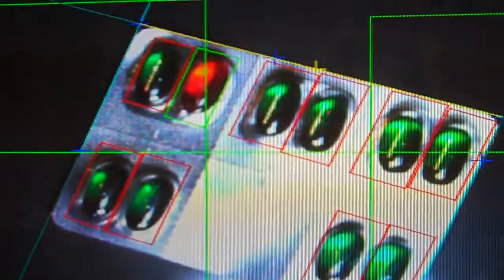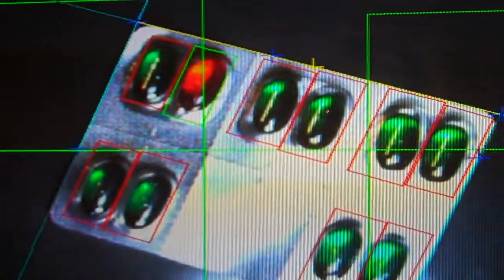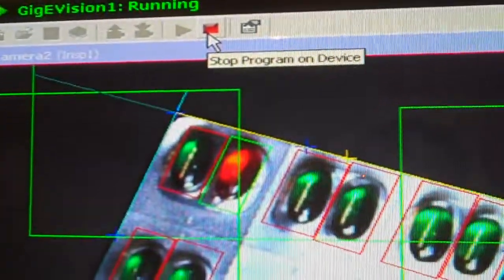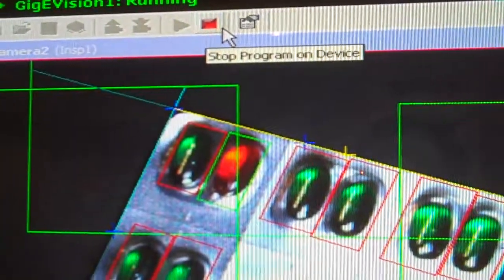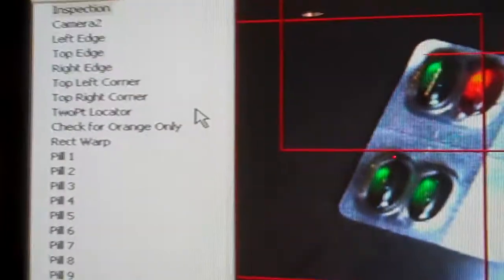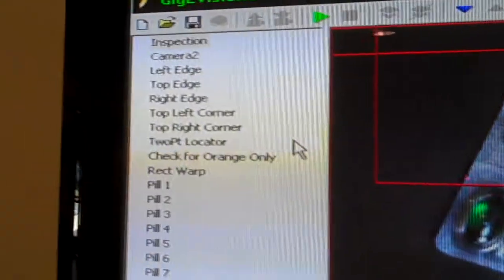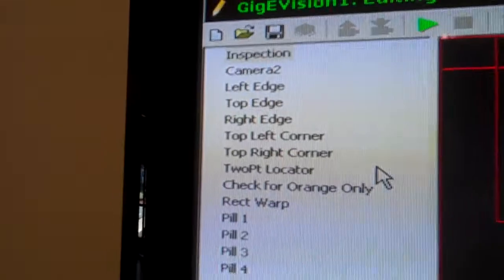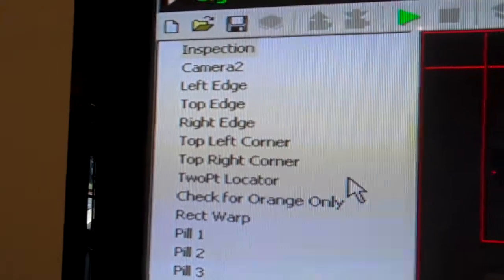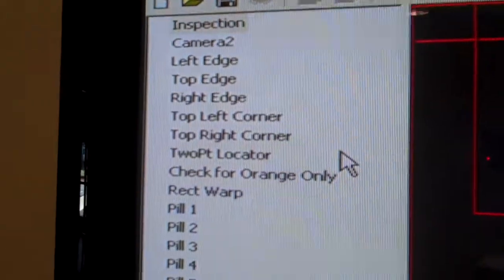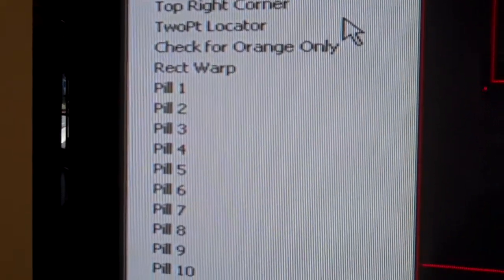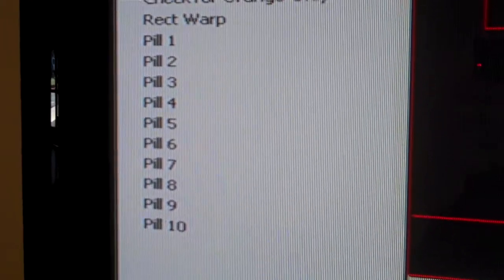And just one other note I wanted to show you here is the fact that this job using Visionscape, if I stop the runtime program, that it's not a highly complex job. Basically start the inspection, find the edges, and then do an individual inspect on each of the pills.